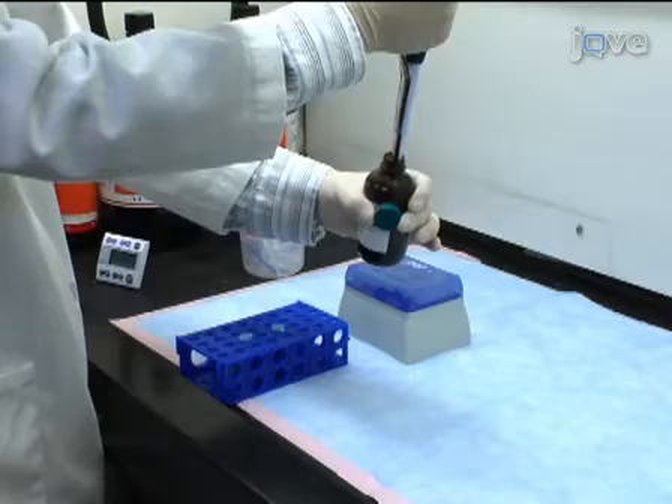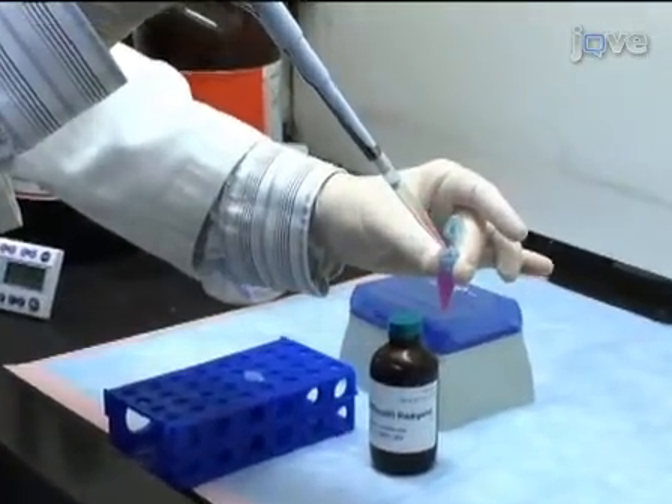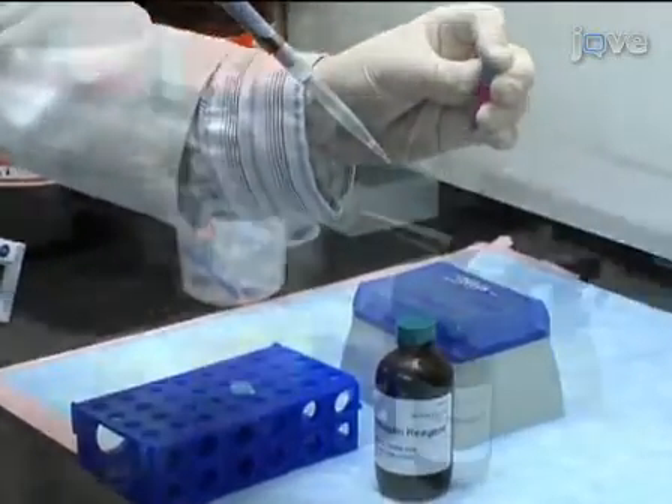Then add 750 microliters of trizol reagent and incubate for 5 minutes at room temperature to permit complete dissociation of nucleoprotein complexes.